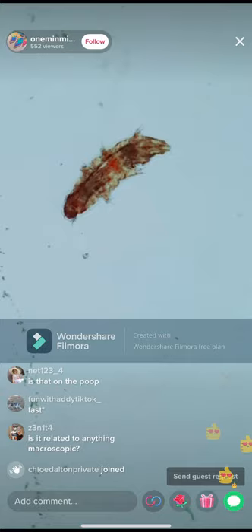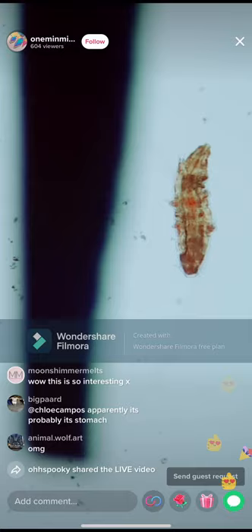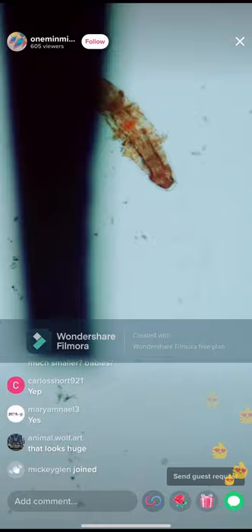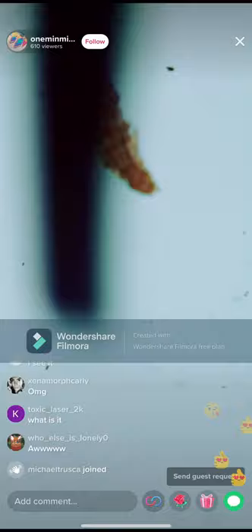I'm going to put a toothpick next to it just so you can see how small it is — this is the tip of a toothpick. Let me get that into the field of view. Can everyone see the tip of the toothpick? The tardigrade is under a glass cover at the moment, so I'm not actually touching it with the toothpick, which means it can walk. It looks like it's walking under it — that's correct. This is the tip of a toothpick, and what is walking under it right now is a tardigrade.